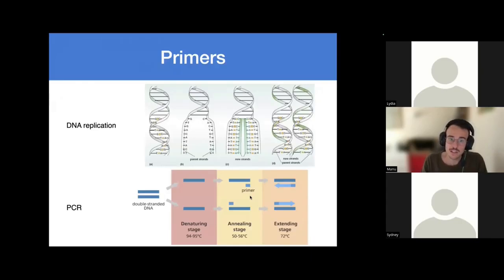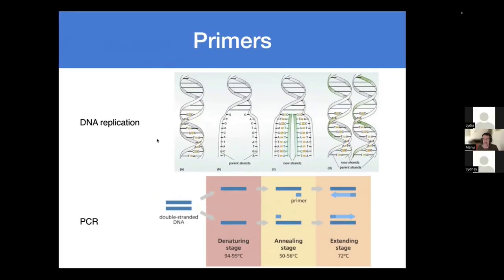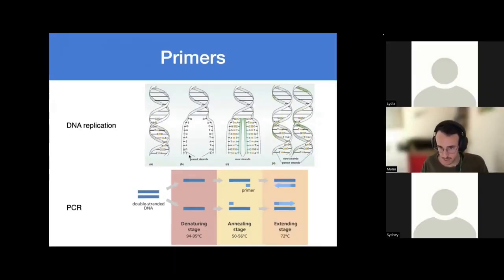The other thing I want to say is that apart from sequences, the users of eLabFTW who are doing molecular cloning will typically use something called a primer. So there is also support for this. A primer is a short fragment of DNA. If you remember from your high school textbook, the way that DNA replication occurs is that you have a helix that is complementary. Something in the cell separates the two helixes, and then the cell fills the gaps with complementary sequences to generate two identical copies of the original one.